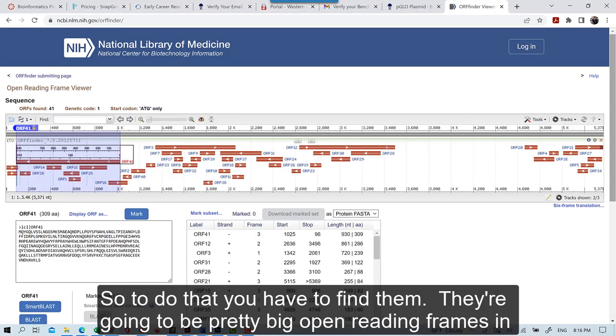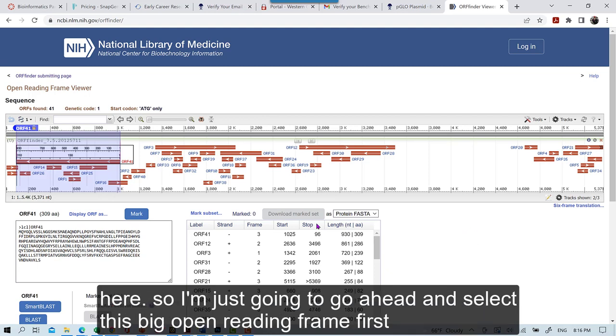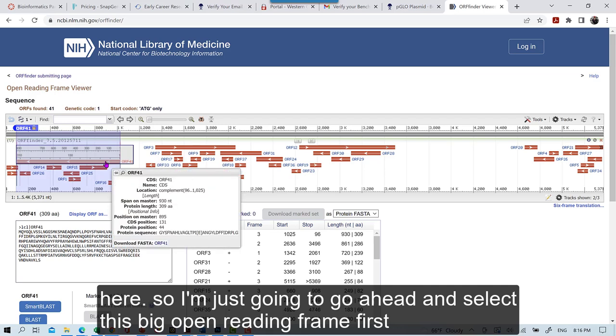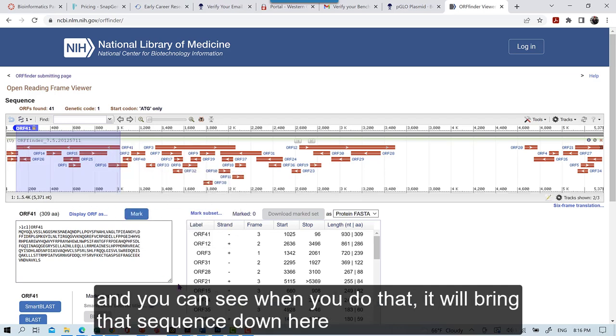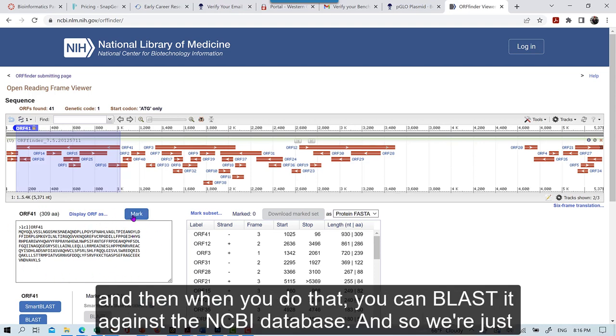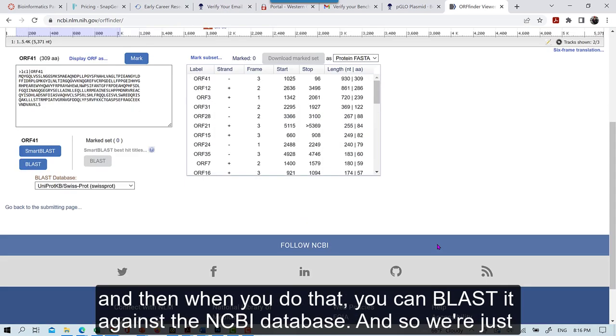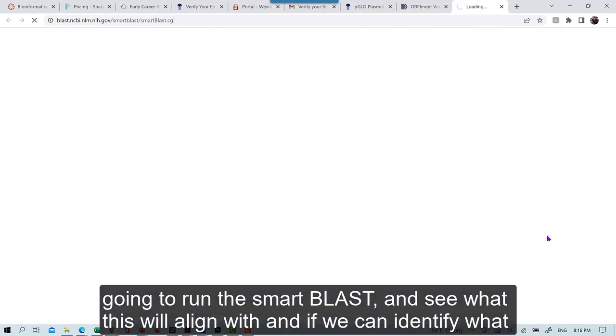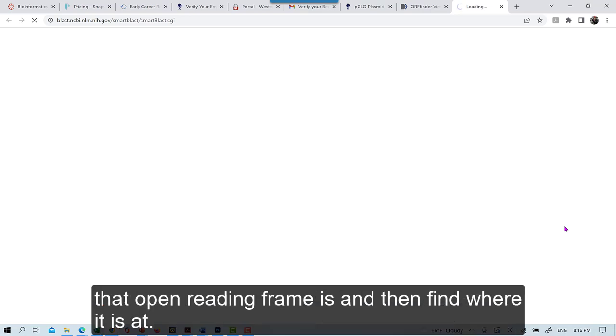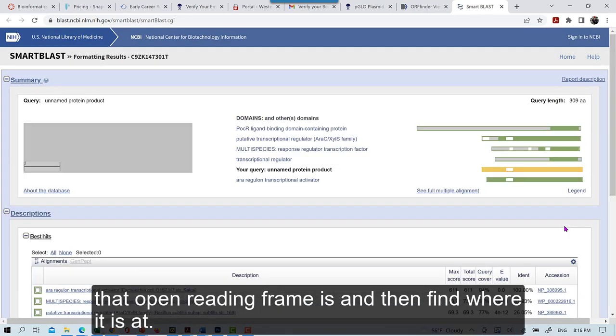Okay, so this is under the control of that product there. So I want you to locate and put in the AeroC and the GFP into your map sequence. So to do that, you have to find them. They're going to be pretty big Open Reading Frames in here. So I'm going to go ahead and just select this big Open Reading Frame first. And you can see when you do that, it will bring that sequence down here. And then when you do that, you can blast it against the NCBI database. And so we're just going to run the Smart Blast and see what this will align with, and if we can identify what that Open Reading Frame is, and then find where it's at.